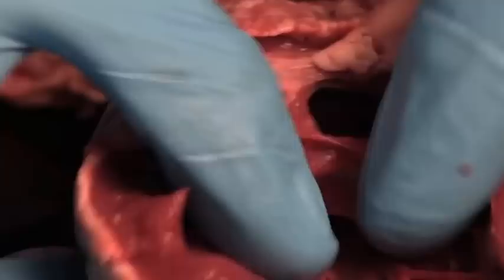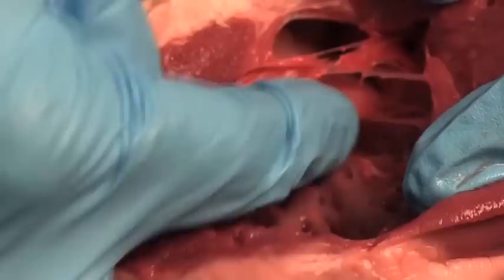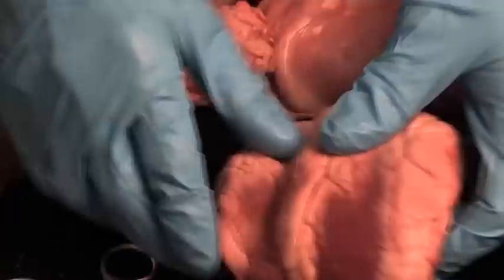Three names for that one valve: the left atrioventricular bicuspid mitral valve. So we've seen the left ventricle — thick wall, left AV bicuspid mitral. And we've seen the right ventricle — thin wall with the right AV or tricuspid valve.